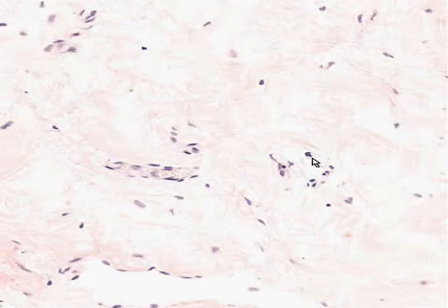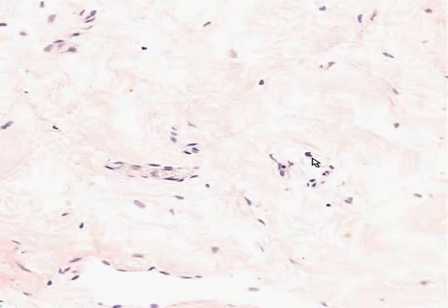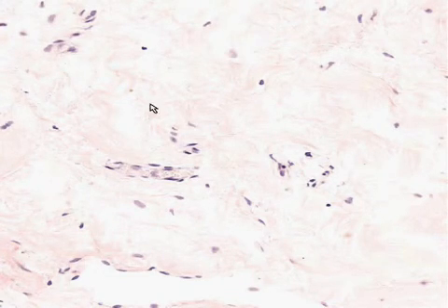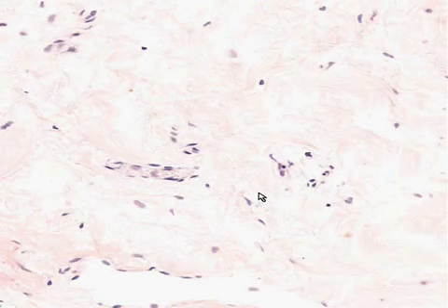This is a classical areolar loose connective tissue, and once again, I will ask you before we close, do you feel that you can really identify absolutely everything within connective tissue? If the answer is yes, then we have fulfilled our mission, and that's what we plan on doing with all of these slides.